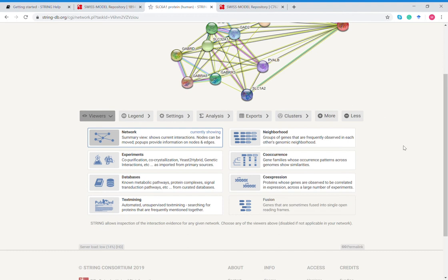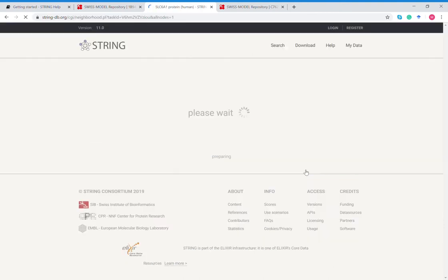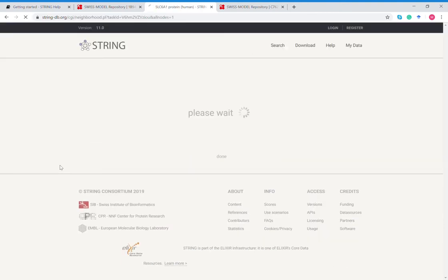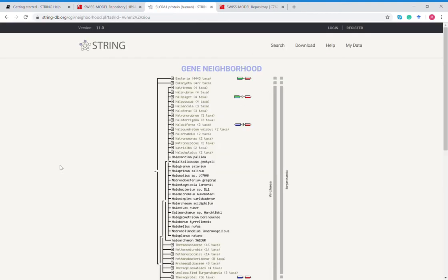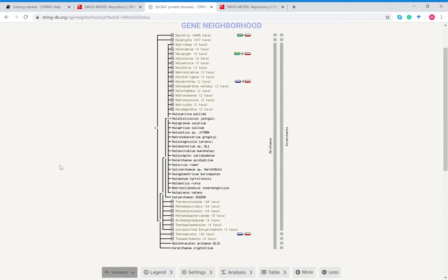Neighborhood, this is groups of genes that are frequently observed in each other's genomic neighborhood. If you click on neighborhood it will show you a comparison of organisms that have the same frequency of genes that are affected by SLC 6A1.